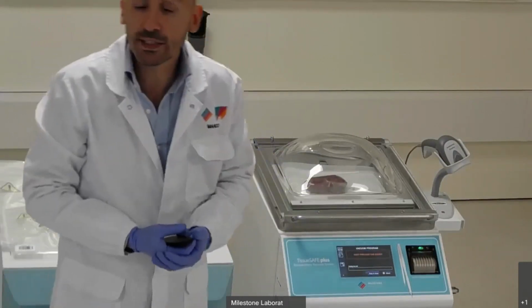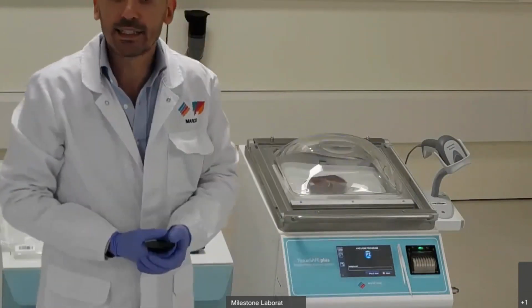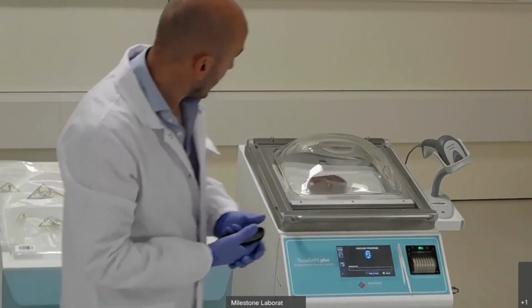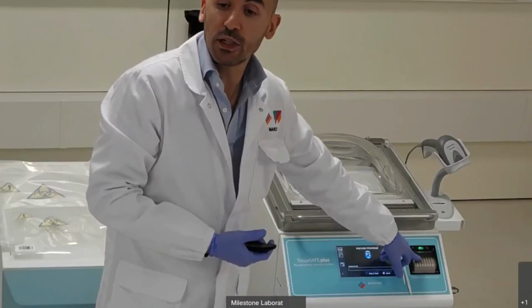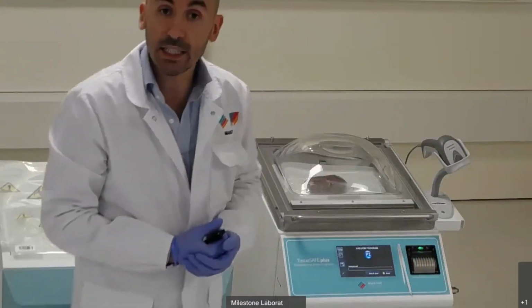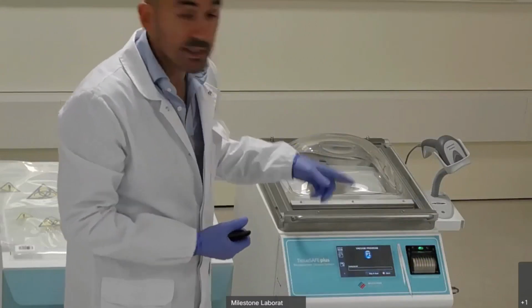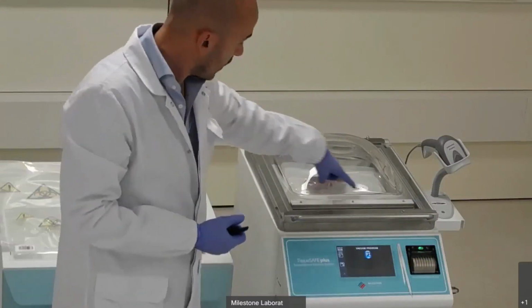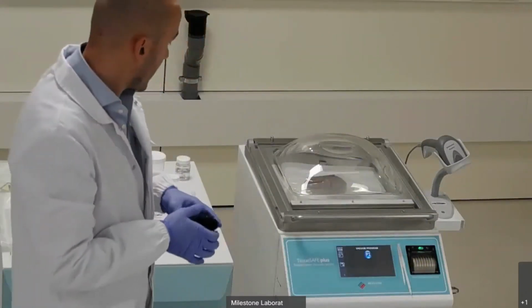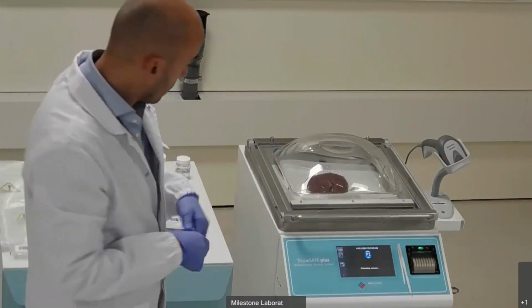What you hear now is the air getting removed from the cavity, and this air is getting out through a HEPA filter. I will anticipate that at the end of the procedure, all the information of this specific procedure will be printed here with the printer I point to now. The vacuum has completed. Now the bar is sealing the edges of the bag, and the air will flow back into the cavity.